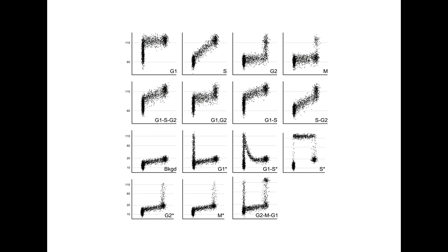In general, DNA is the primary base marker. It provides a three-compartment subdivision ordered in time, G1, then S, then G2 plus M. Periodically expressed genes or activities subdivide these phases further with the goal to create a model with objectively defined compartments that are unambiguous. That is, the cells pass through each compartment unidirectionally once.